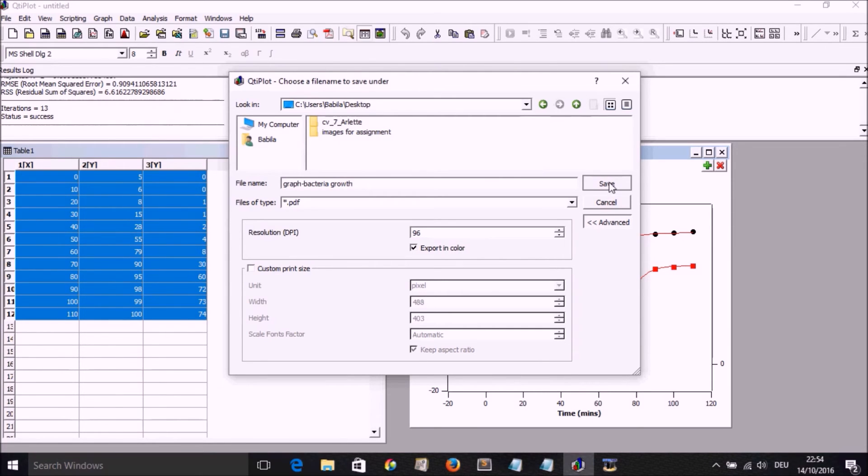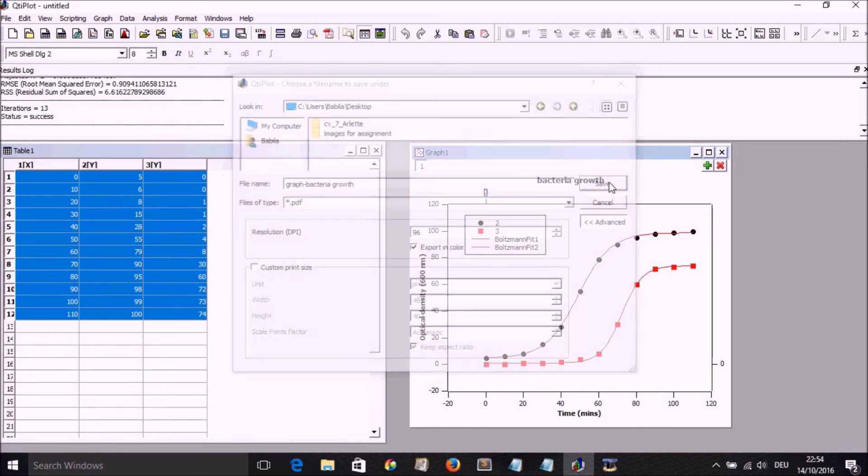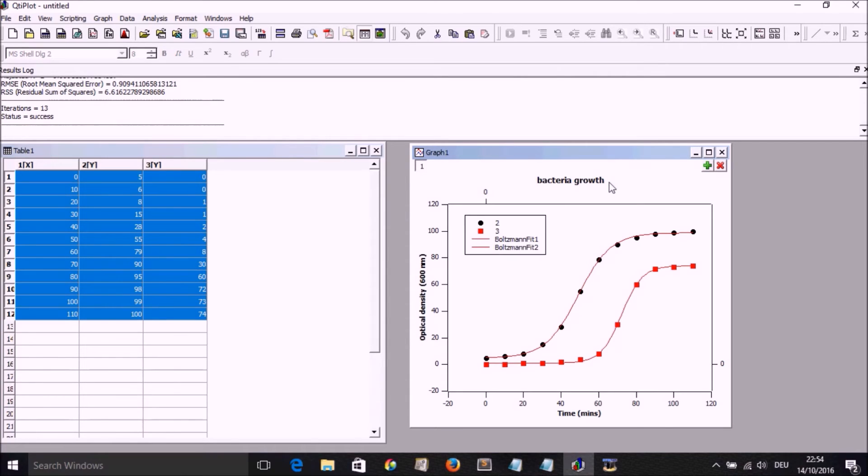So go save. And that is it. We have our plot.